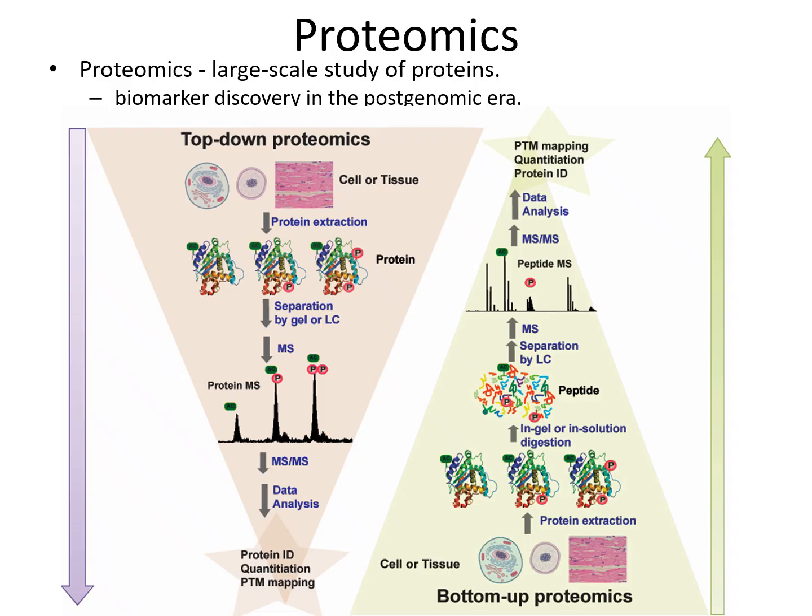And then here I show the proteomics. There are two different types of preparation for the protein for the downstream analysis. So we can have this peptide-based bottom-up shotgun proteomic approach. Basically, you extract the protein from the sample, and then you digest the protein into small fragments of peptide, and then you separate these peptides so that you can analyze each individual peptide. So that's called peptide-based bottom-up shotgun proteomics.